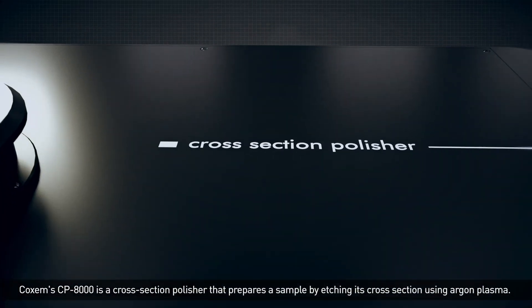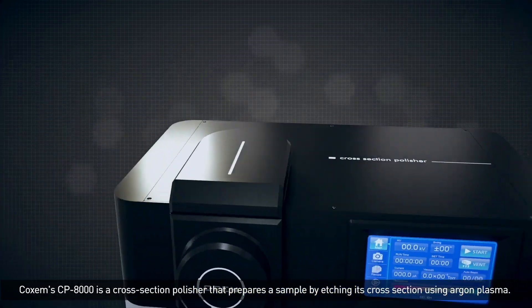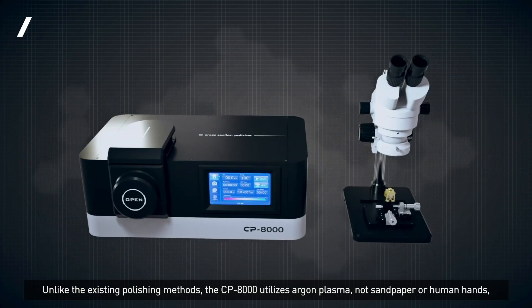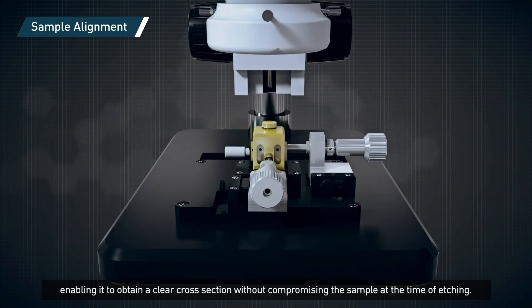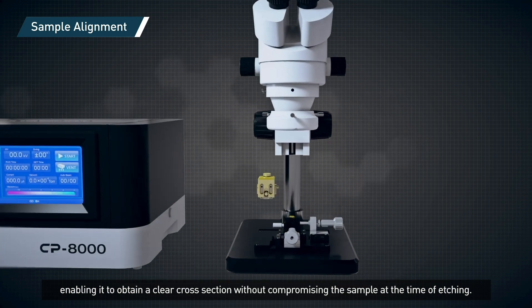Coxem's CP8000 is a cross-section polisher that prepares a sample by etching its cross-section using argon plasma. Unlike existing polishing methods, the CP8000 utilizes argon plasma — not sandpaper or human hands — enabling it to obtain a clear cross-section without compromising the sample at the time of etching.